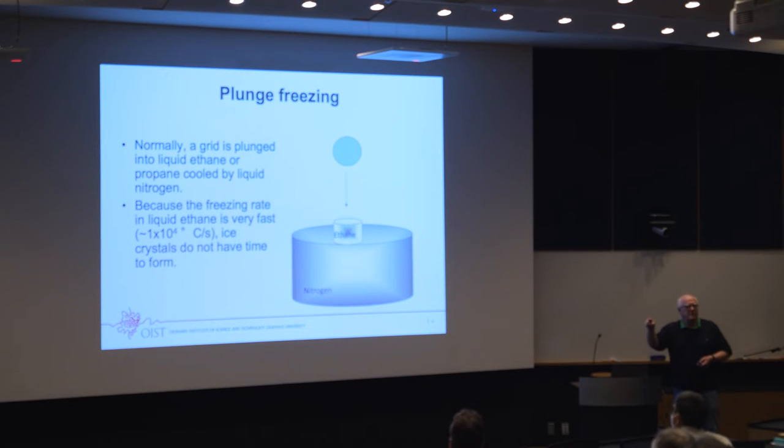You might know that if you accidentally freeze strawberries in the fridge, you take them out and thaw them and they are just saggy blobs, right? That's what's happening: the ice destroys the cells. But with this procedure, you can preserve the specimen because it's so fast. It's even faster than it looks, because the transition temperature is at minus 44 to 45. In that very small temperature interval there is a phase transition and you get the solid material.